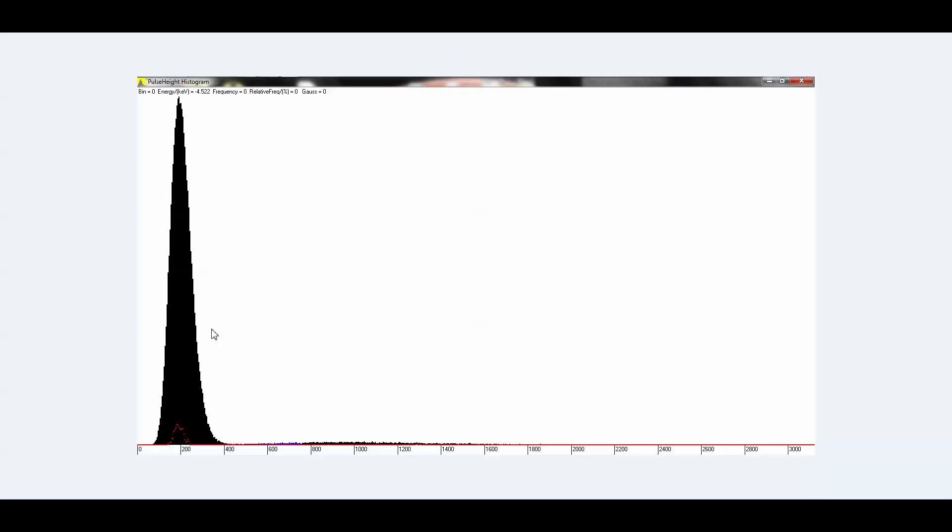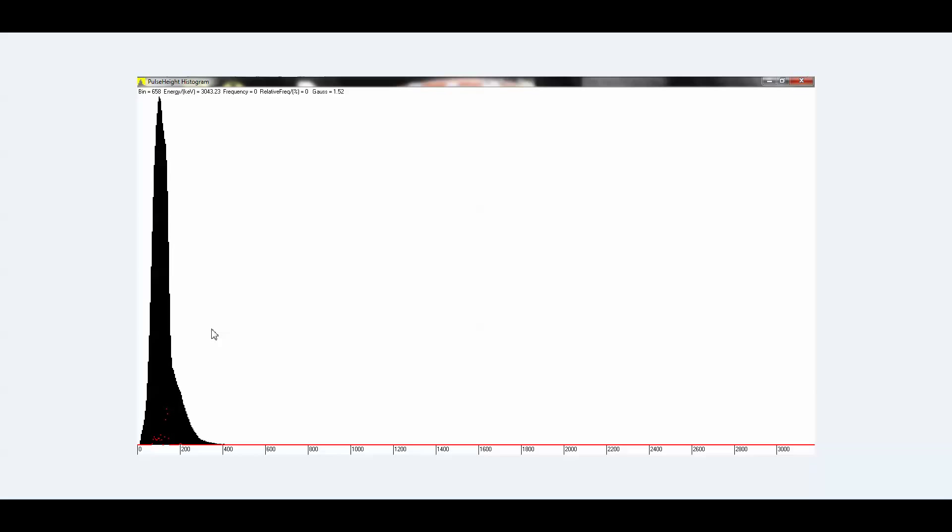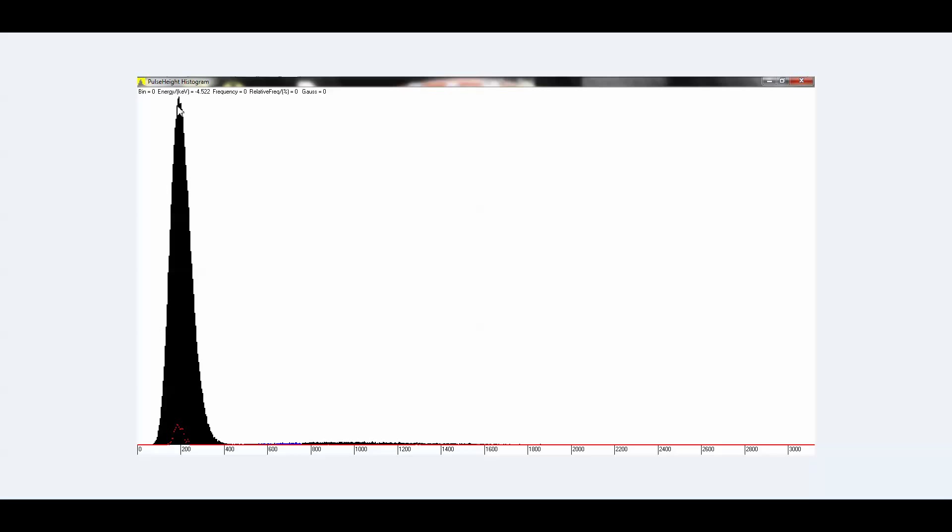And you see it shifted. Let's go back. And then let's go forward once more. As you can see, there's still some lead X-rays coming through here. But the shift is much better now, much towards where it's supposed to be. And this Gaussian correlation peak here shows that we're pretty much right on the money for Technetium-99. So good job there. That looks pretty good.